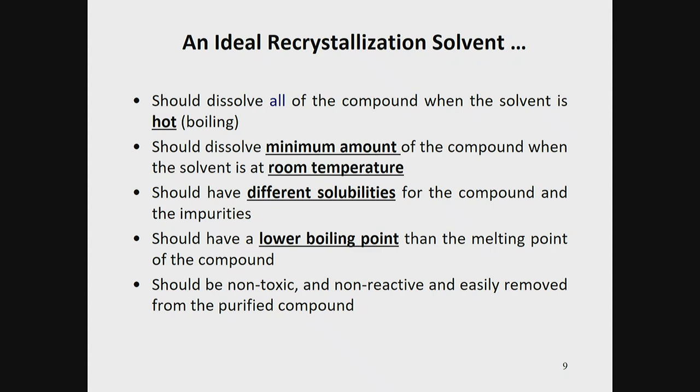So when you have your unknown solid, we want the solid and the impurities to go into solution at high temperature. But as it cools down, we want the solid to come out of solution, but the impurities stay in solution, okay?